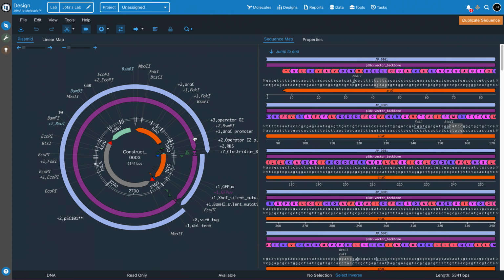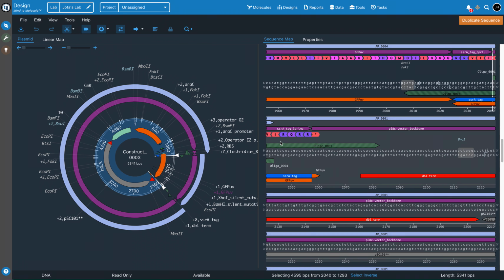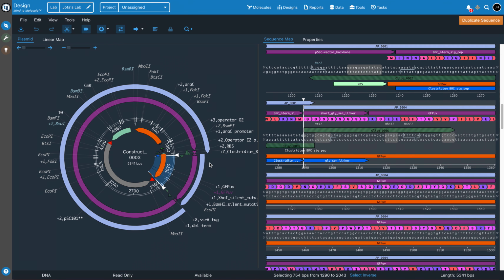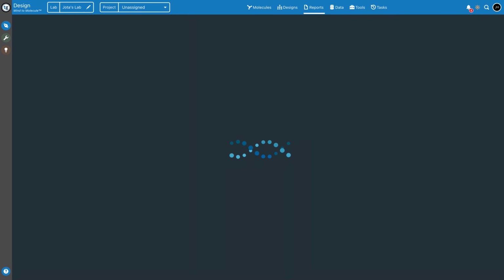It's going to be fully annotated with the original annotations, plus it's going to indicate to you the assembly pieces. For example, this is the assembly piece that was used for this construct, and here you can see there's another assembly piece. And these pieces contain the vector, the GFP, the SIGPEPs, and everything that we had on our design previously. Let me go back to the assembly report.